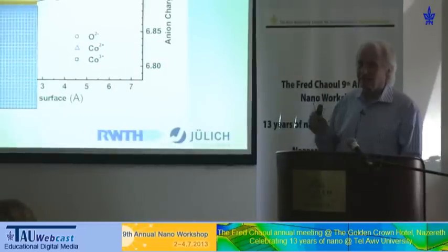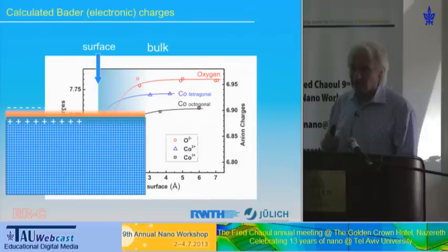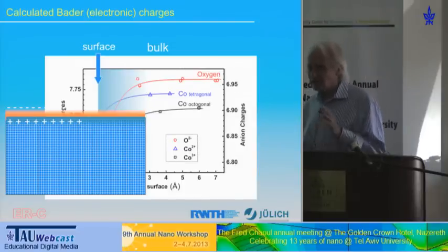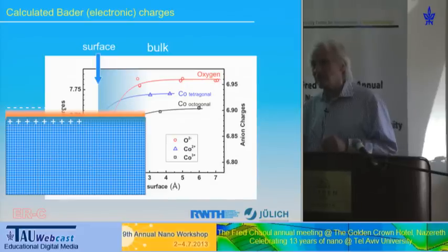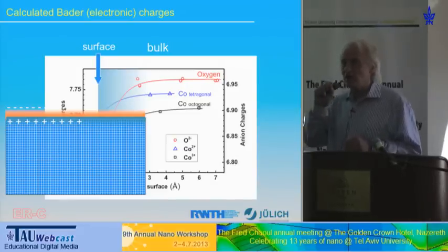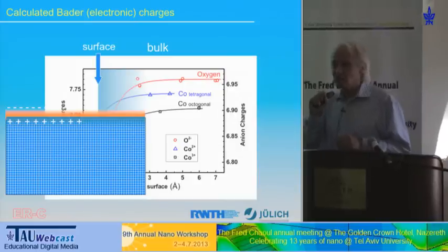But in any case, that's not an oxygen column. It has to be a strontium or a barium column. So it's quite sensitive, because we have nowadays the means to do calculations on an absolute scale.